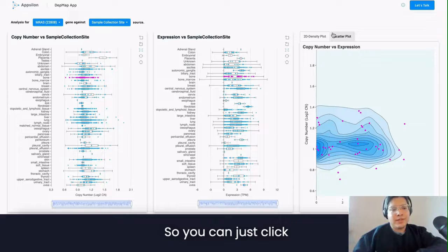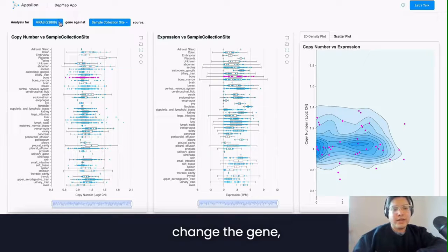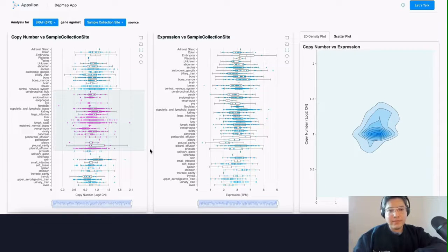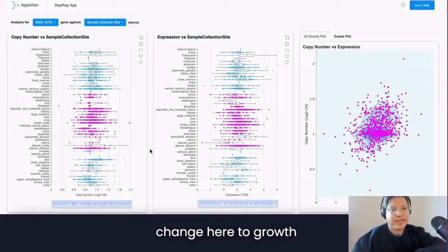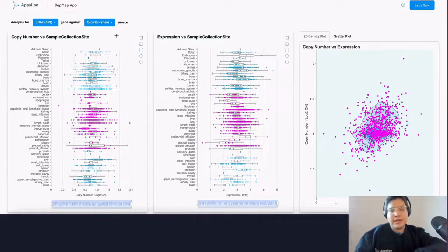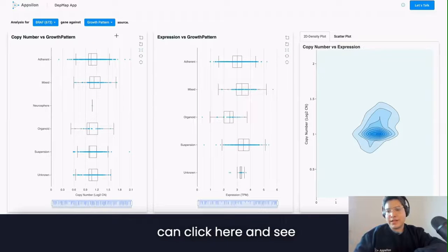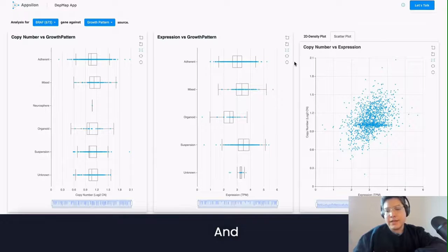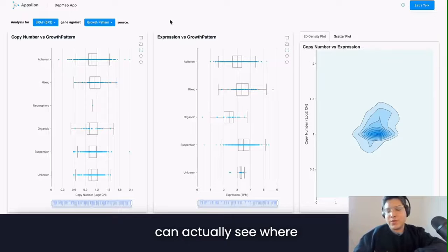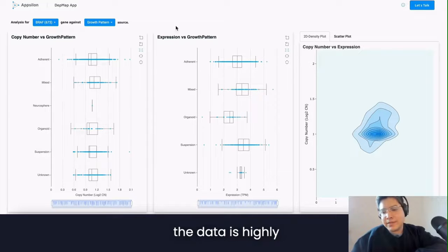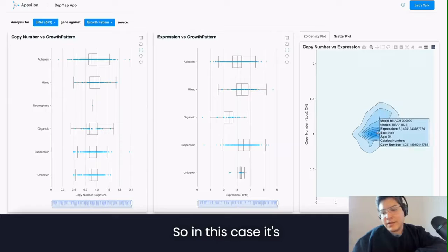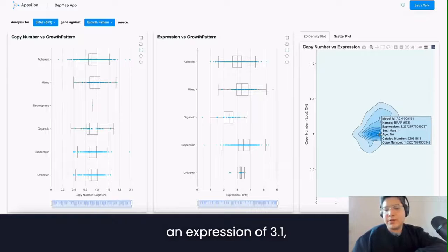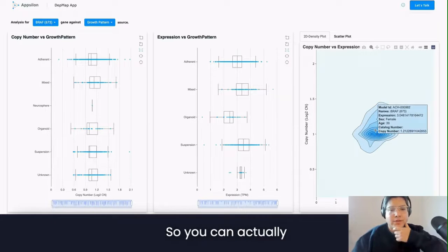It's very interactive — you can just click here, change the gene, select multiple samples, and you will see all of those on the plot. You can also change here to growth pattern and see the visualization. Click here to see the scatter plot. This visualization is really nice because you can actually see where the data is highly concentrated — for example, a CNV of 1 with an expression of around 3.1.